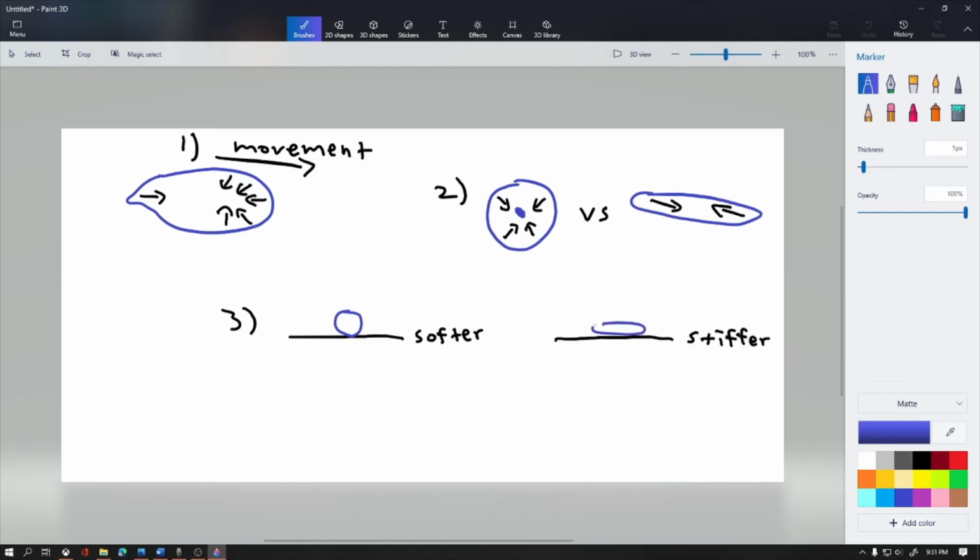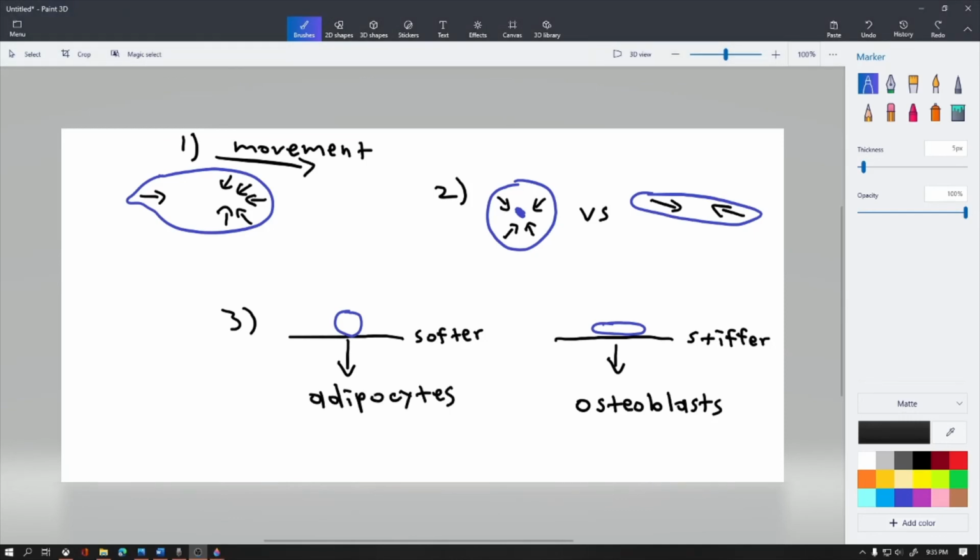A few studies examined how mesenchymal stem cells, or MSCs, may spread or ball up depending on the stiffness of the surface substrate they rest on, and that this shaping can actually determine if the cells become osteoblasts, bone cells, or adipocytes, fat cells. Other works now also seek to eventually connect these cellular mechanics to larger-scale tissue formation and manipulation.